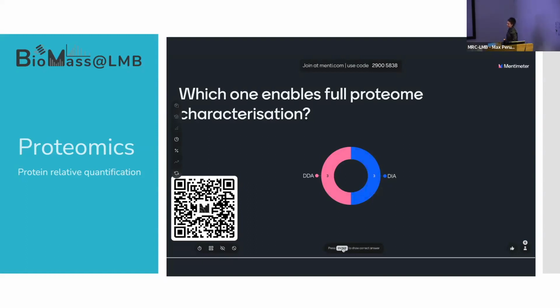With DDA, you can get a really complete proteomic characterization if you're using TMT, because TMT works with DDA. You have to get a really good isolation, as specific as possible of the peptide that you want to fragment. Because if you have co-isolation of other peptides, when you're looking at the reporter ions, you're getting cross information about the quantification from different types of peptides. But because you can inject your sample 18 times, and each fraction has a different composition, you get full proteomic characterization.